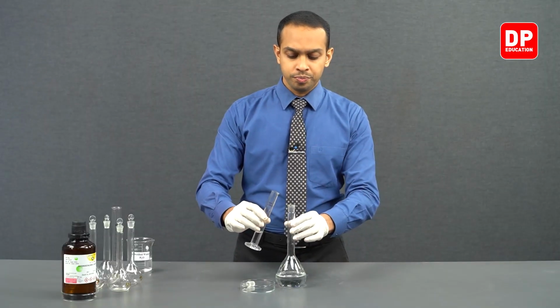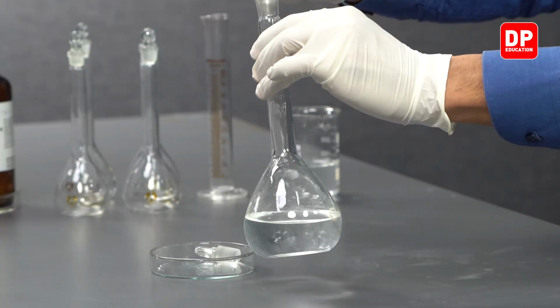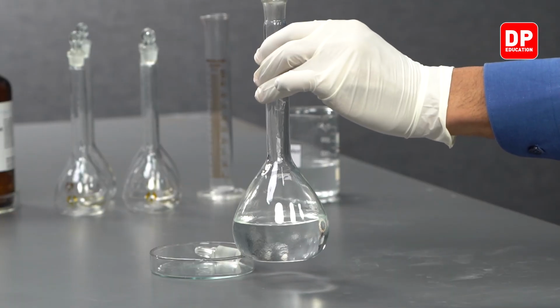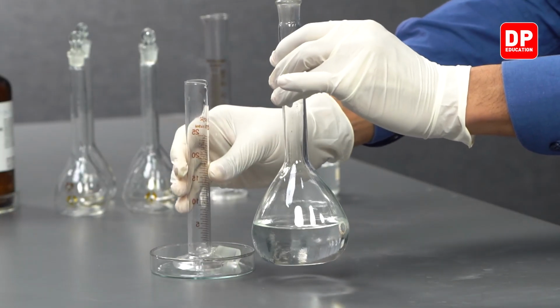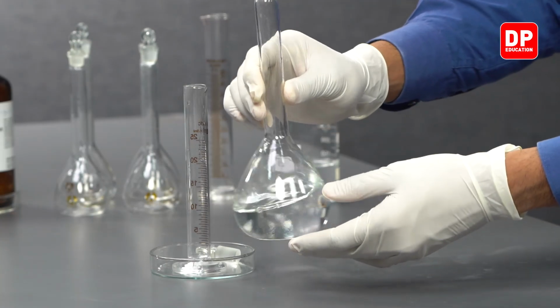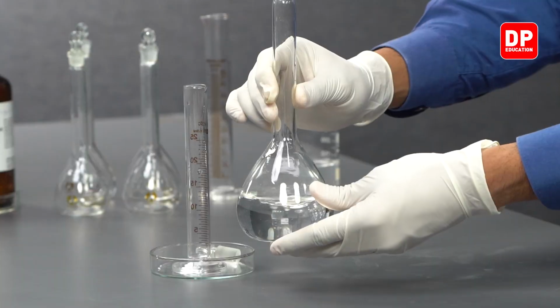And now we'll transfer the whole amount of HCl into our volumetric flask here. And we'll swirl it around. This is slightly exothermic.